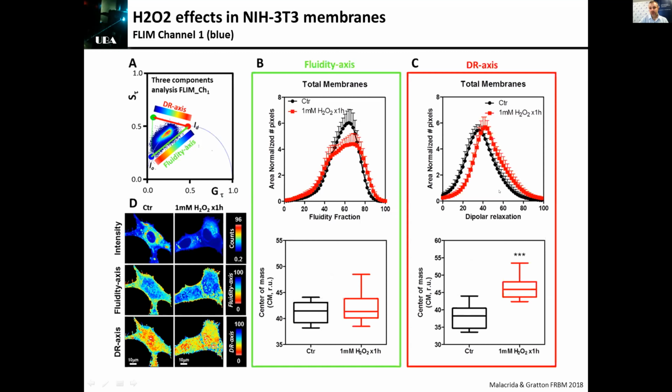We did the same for the dipolar relaxation. And what surprised me immediately was that we do have a change in the dipolar relaxation in the blue channel. And this was unexpected. Let's keep this in mind for the discussion at the end.